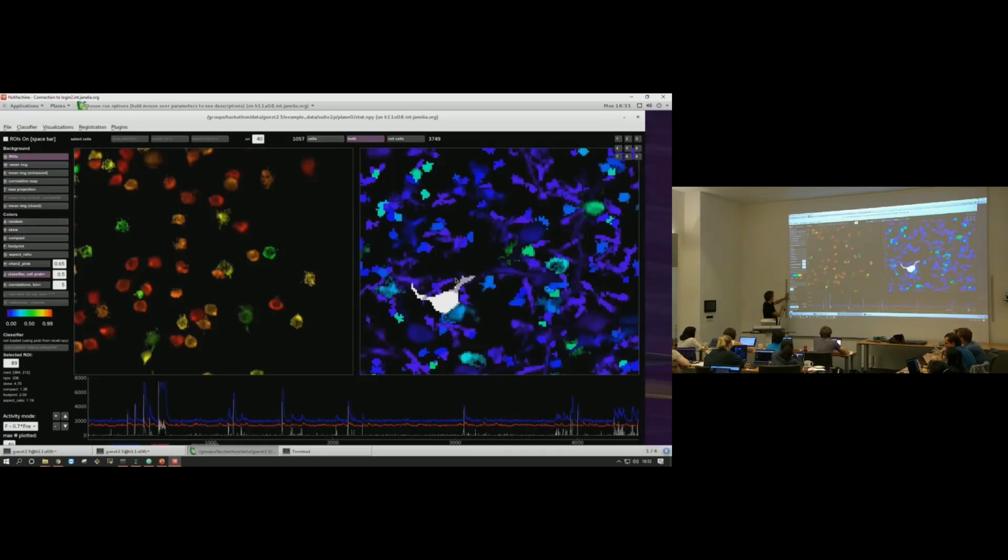They're all a little bit redundant with each other: the size, the footprint, and the number of pixels. They all get normalized to the field of view, so it's not just the number of pixels, but it's normalized to the average number of pixels for an ROI. That's what goes into the classifier. But yeah, it's built based on these numbers.